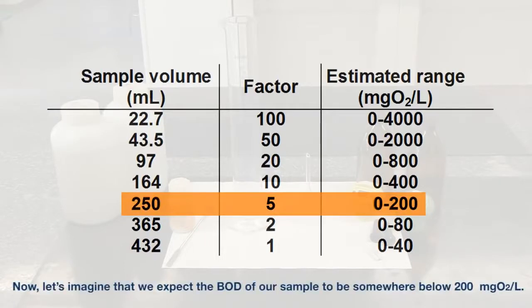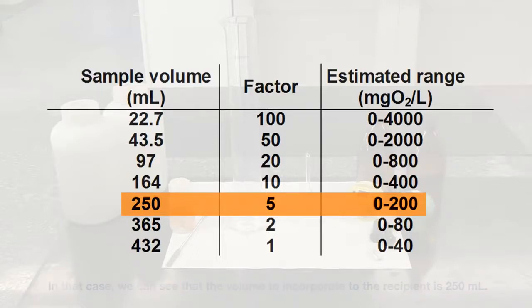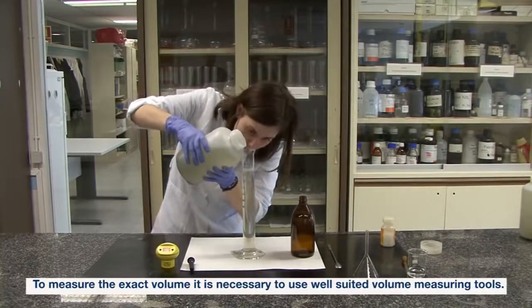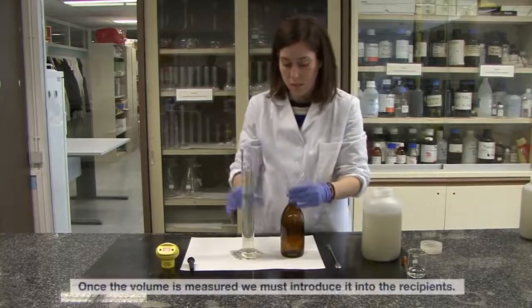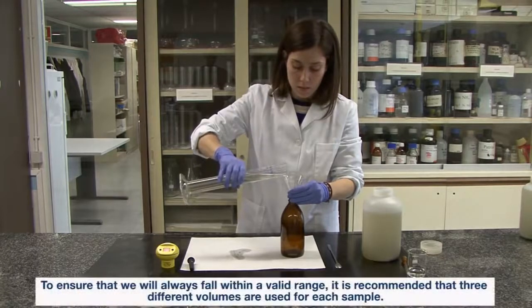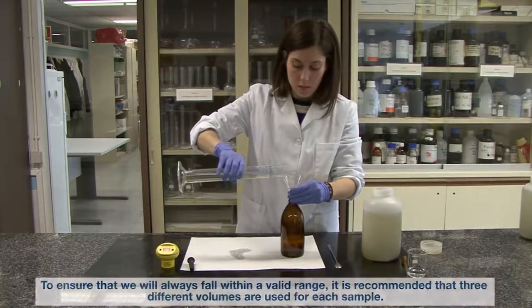Now, let's imagine that we expect the BOD of our sample to be somewhere below 200 milligrams of oxygen per liter. In that case, we can see that the volume to incorporate to the recipient is 250 milliliters. To measure the exact volume, it is necessary to use well-suited volume measuring tools. Once the volume is measured, we must introduce it into the recipients. To ensure that we will always fall within a valid range, it is recommended that 3 different volumes are used for each sample.